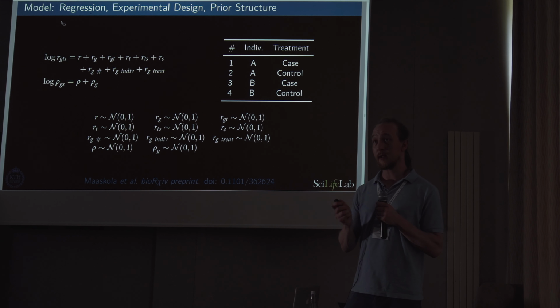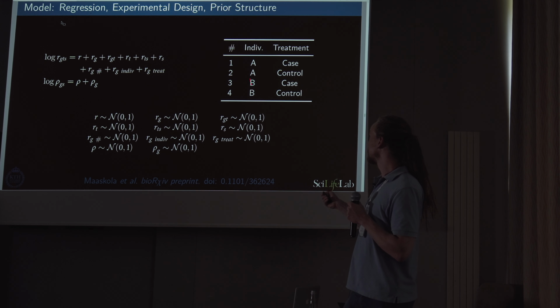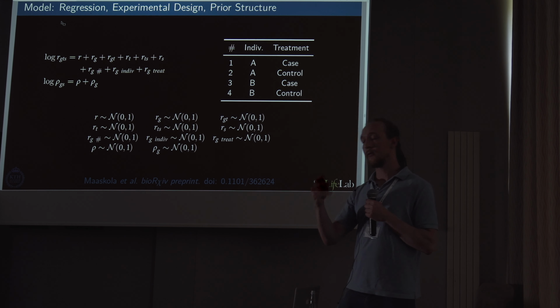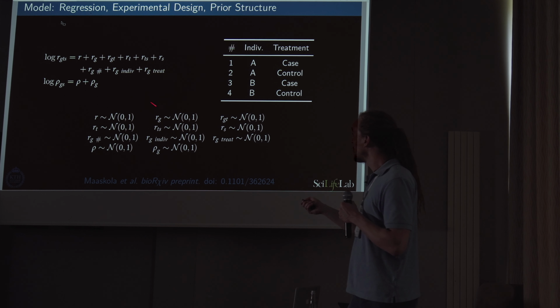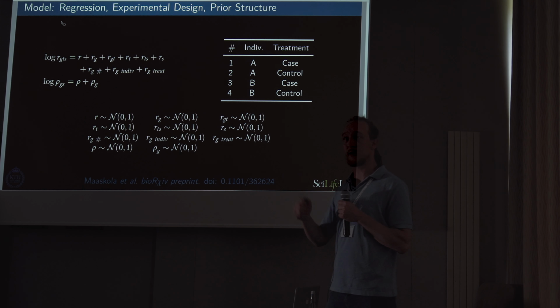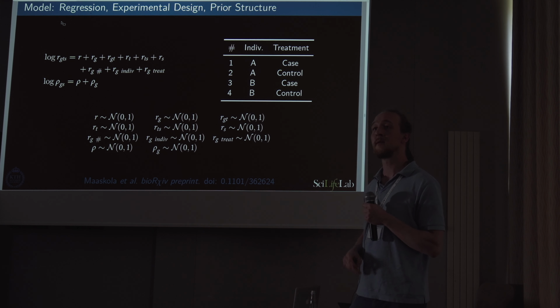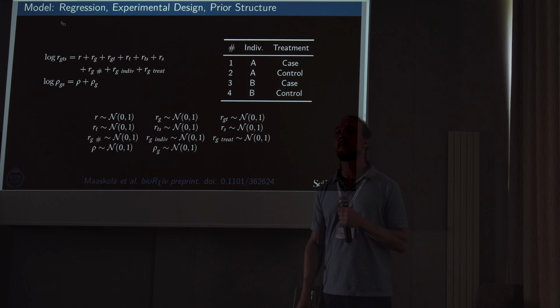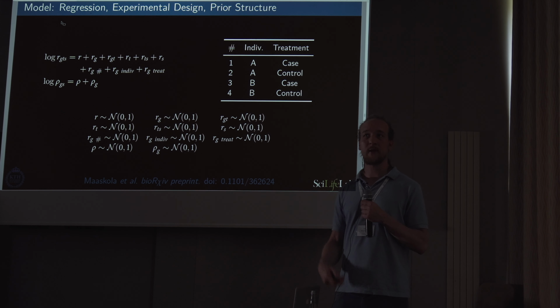These are just labels, really, that we don't interpret user-annotated covariates in a quantitative way. For this reason, these coefficients are completely free, subject to fit and subject to the prior. But you mean you could have multiple covariates? For example, which date they were processed and all that. Exactly, which experimenter, what treatment conditions and such.